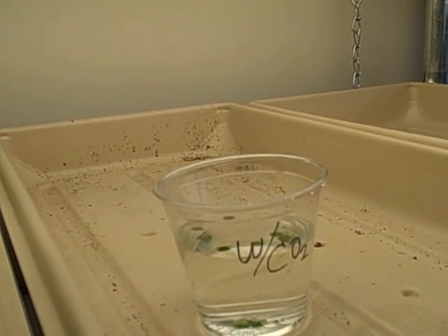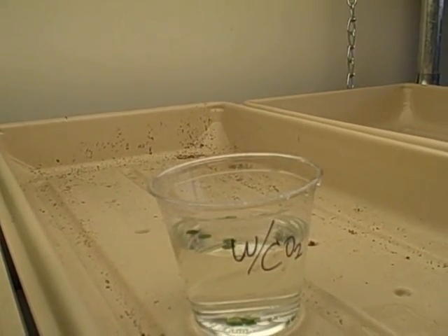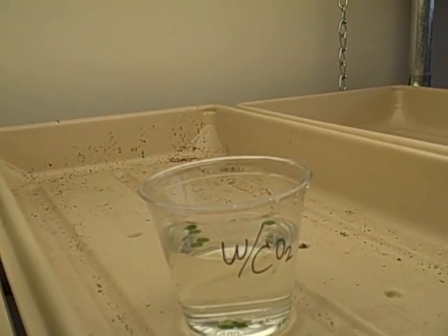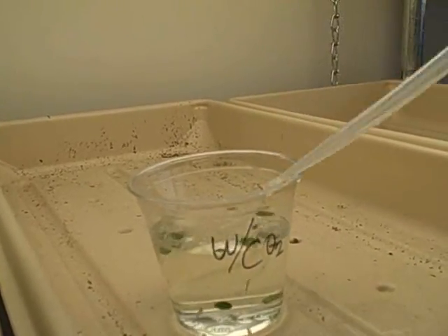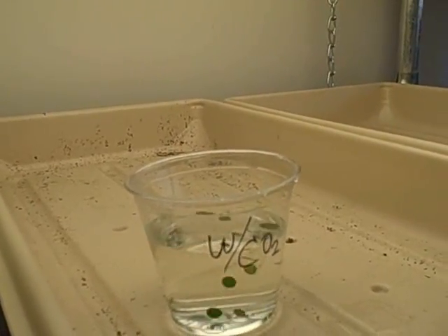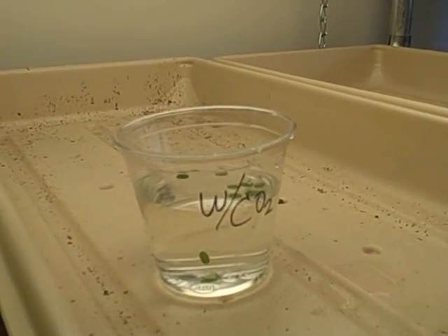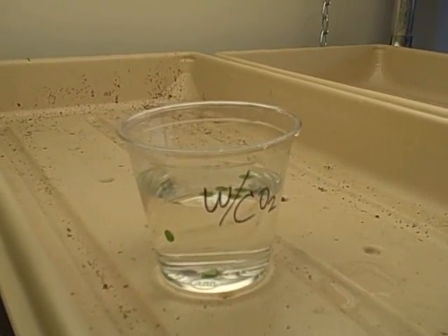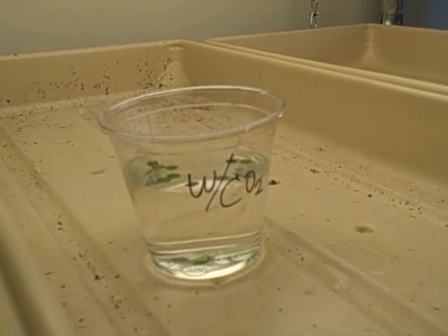At eight minutes: one, two, three, four, five, six, seven — seven are floating at the end of eight minutes. Coming up on nine minutes, at the end of nine minutes we have all but one floating.